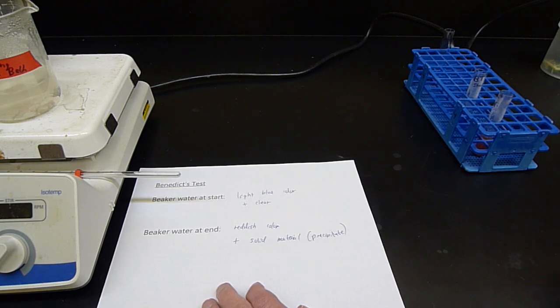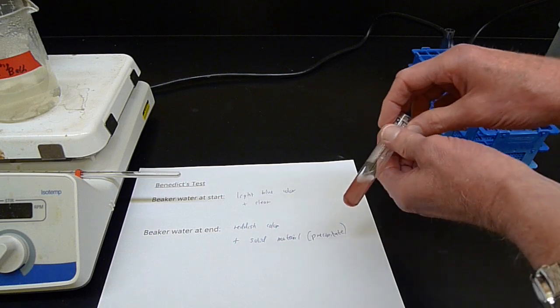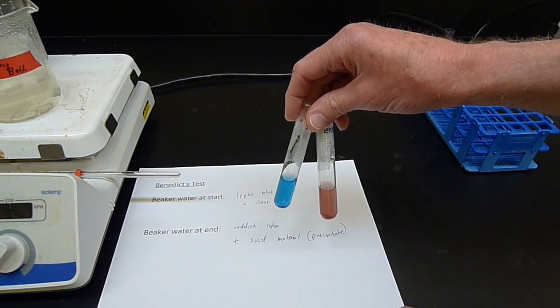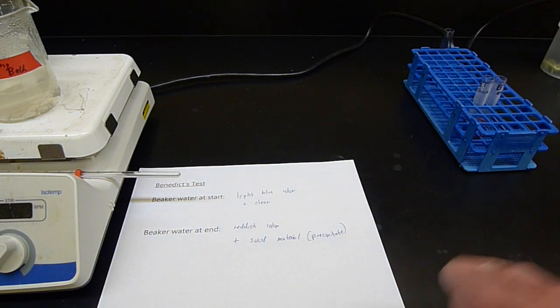Precipitate is something that comes out of solution, a solid that comes out of solution. But notice this looks pretty different than the Benedict's test at the beginning. You can make conclusions about what that must mean. We're going to do some stuff on osmosis next.